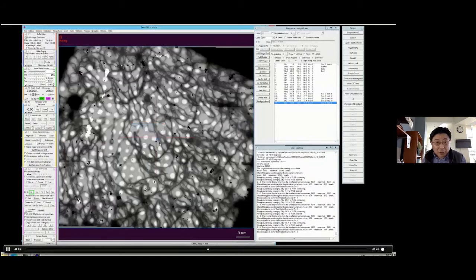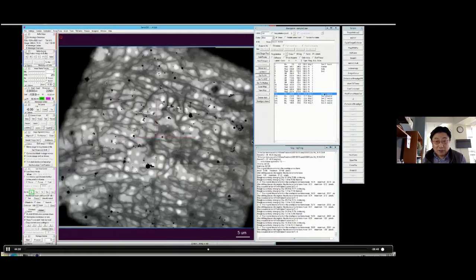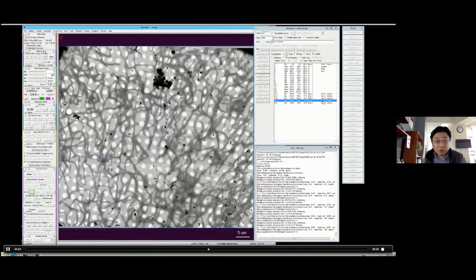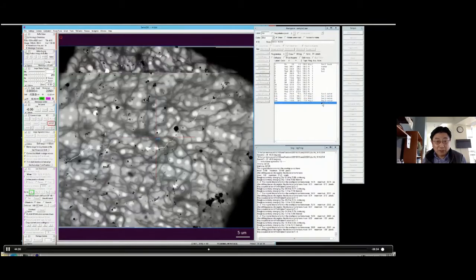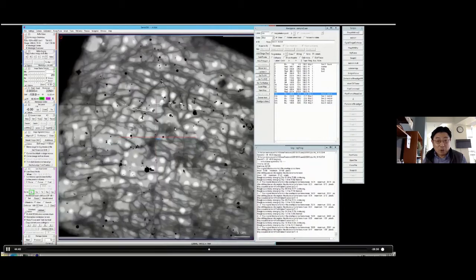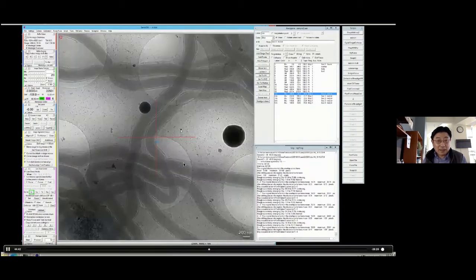Okay, so this is finished. You can click each of them, then you can zoom in. Again, this is almost like Google Maps. You can look at them, and clearly they are different. Some are slightly more dry, some are less dry. And this is zoomed in, so you can move around.